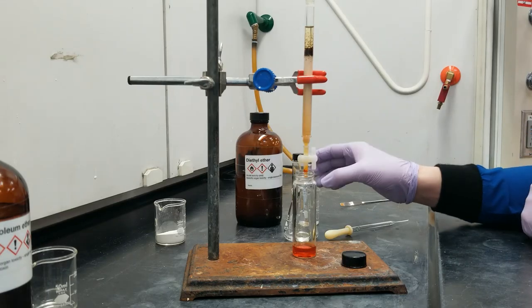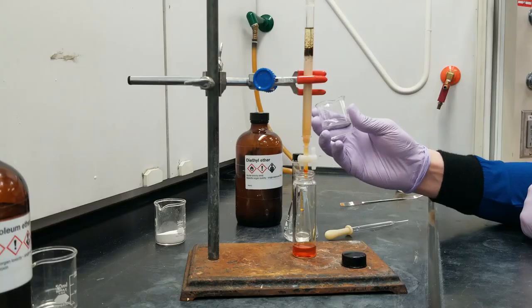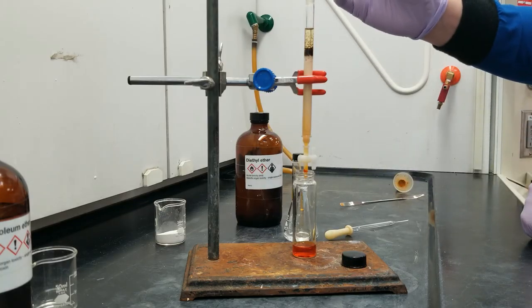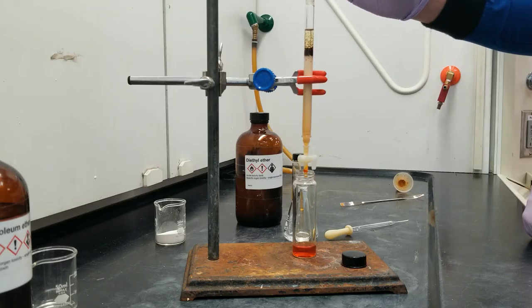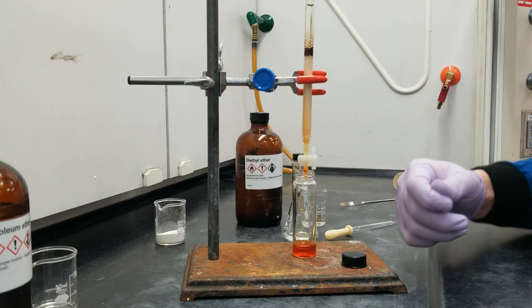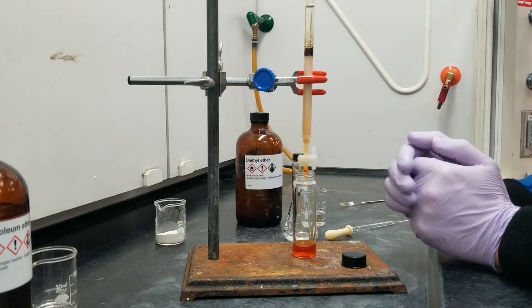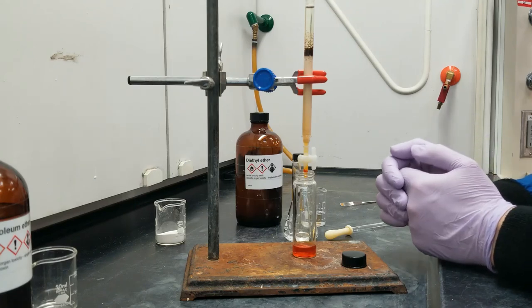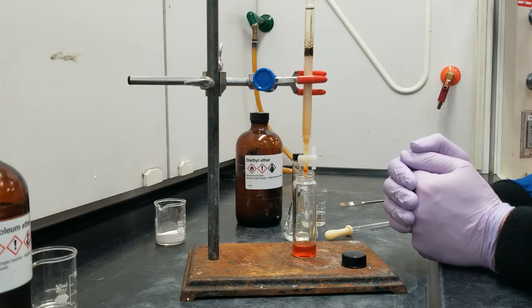Now when we're using a more polar eluent, or solvent, the product is going to come out a lot faster, so I'm going to use less of it. In order to isolate the ferrocene and acetyl ferrocene, I will need to remove these volatile solvents by airstream, which can take a while, so it's practically a lot easier if I can minimize the amount of solvent.